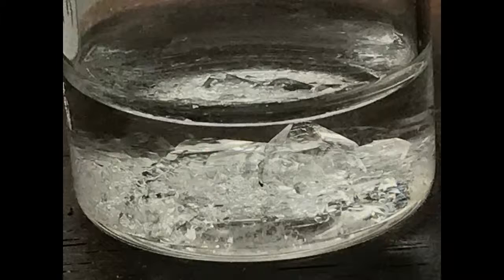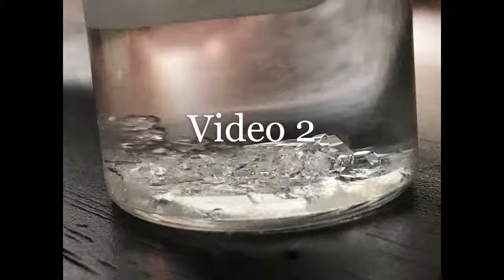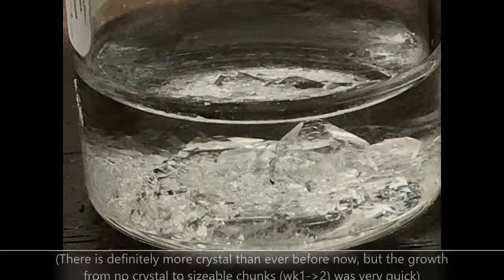There haven't been any environmental changes for my vial of alum crystals thus far. We see that there's definitely been more crystal growth, but it does seem that the bulk of the crystal growth had occurred between videos 1 and 2. Since then, the rate of growth seems to have slowed down.